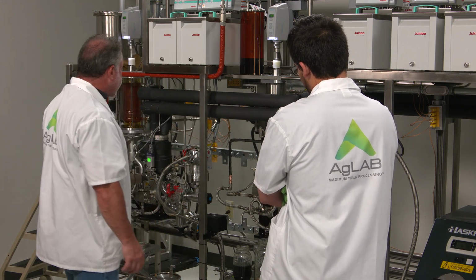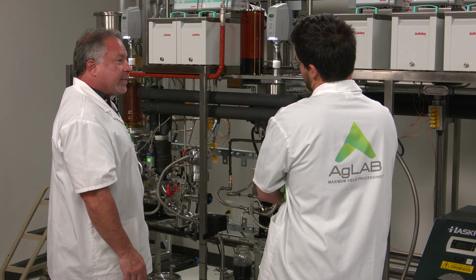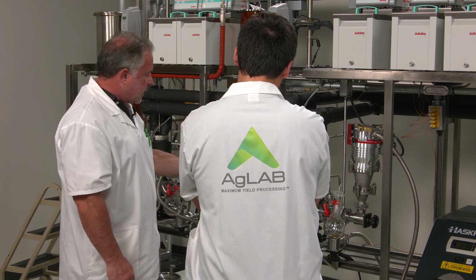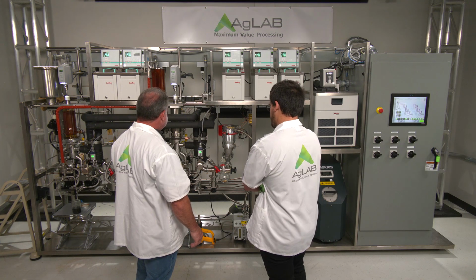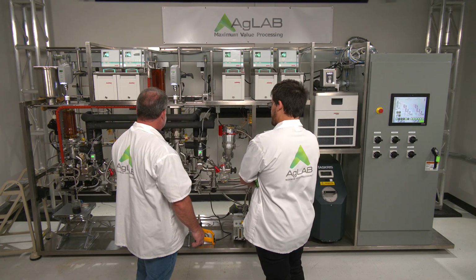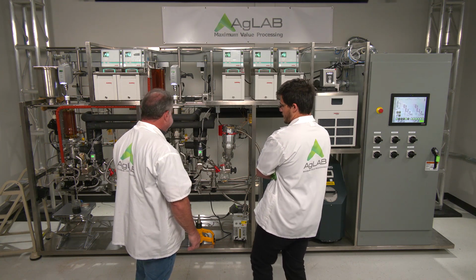Anytime that you can remove all your terpenes, because anything left over, any of those highly volatile analytes, cause problems for your vacuum. If you can get rid of all that stuff and have really heavy molecules and then your CBD left over, you can get a good separation here and good yields on your product. Okay, that makes sense. That was a good question. That was a good setup. So that's why the heavy is always second, because we have to take it to deep vacuum, but to do that we have to remove everything that's going to cause it to go crazy.